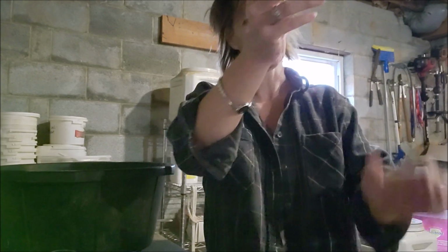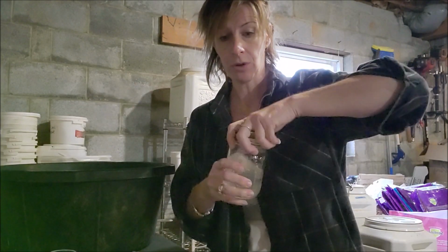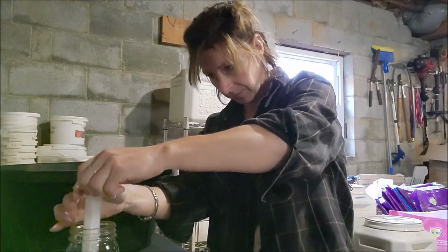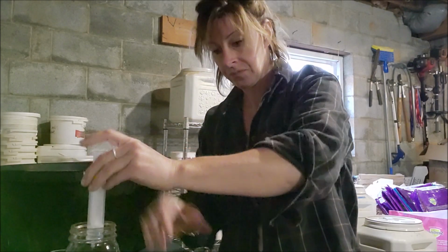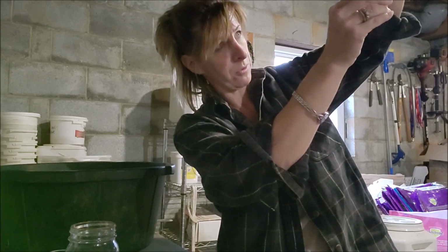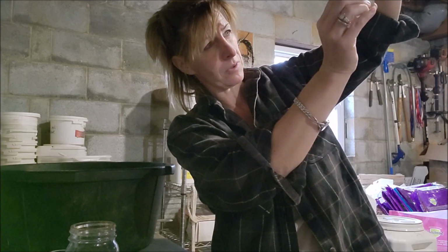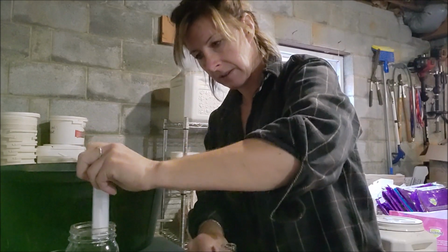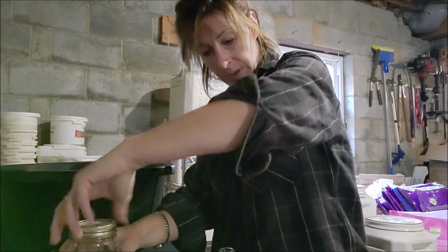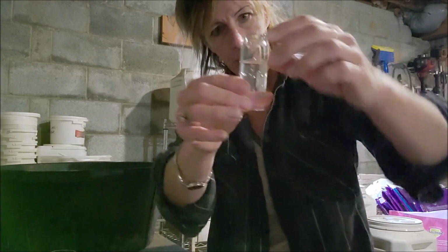Okay, so now you want to make sure, oh, I'm a little short. You really want to make sure you have your weights and your measures right, because if it's off, you won't have enough solution to make the eggs float. And if you have too much poop, then it's just going to be too much. So I can see the solution in there. Okay, now we're good. You don't want to go too much, you don't want to go too late. This is the reason why there's lines all over this. All right, that's good. So now we're there.